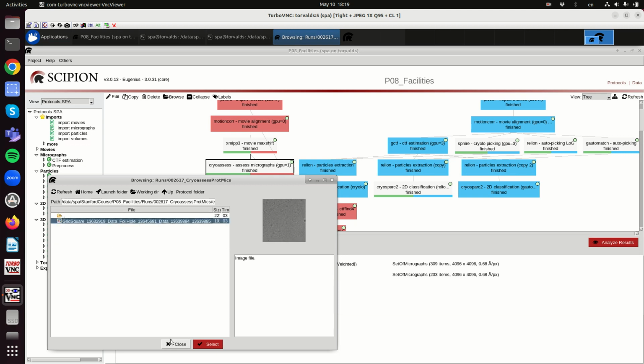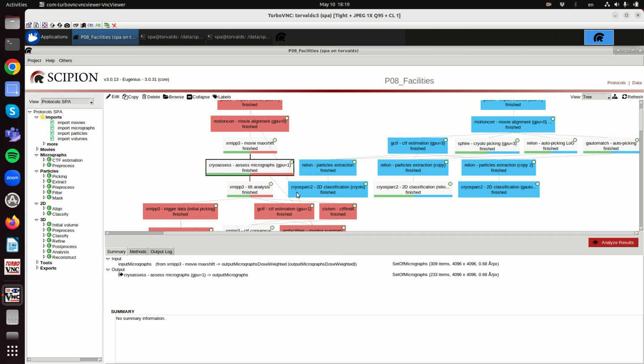And it is again about 20% of the movies that survived the motion filter. They have failed because of different ice problems. And then some of them we can analyze the tilt, so whether the electron beam should be perpendicular to the sample, but sometimes it is not fully perpendicular.